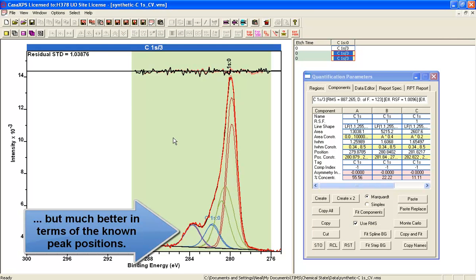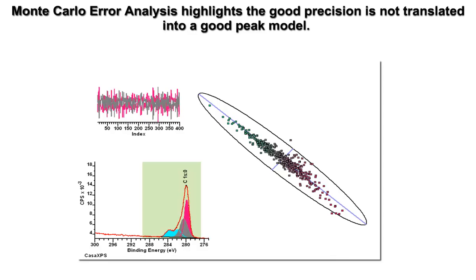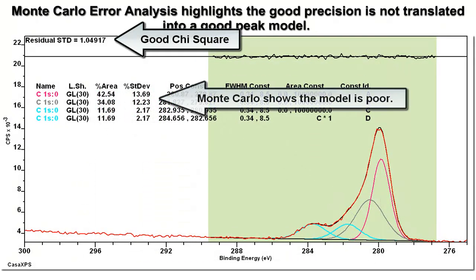It's improved over the GL50 without constraints. So you can introduce constraints to improve the quality of your peak fit. But it's very, very difficult to come up with the right answer based on the residual standard deviation. In fact, the Monte Carlo method for looking at error analysis indicated this peak model was, in fact, really quite bad.